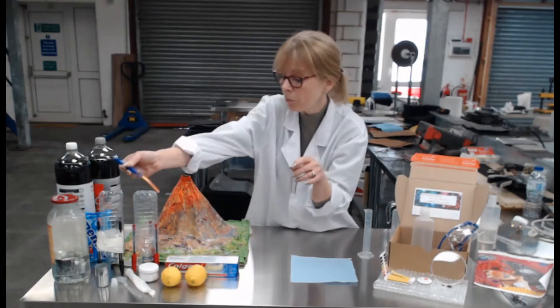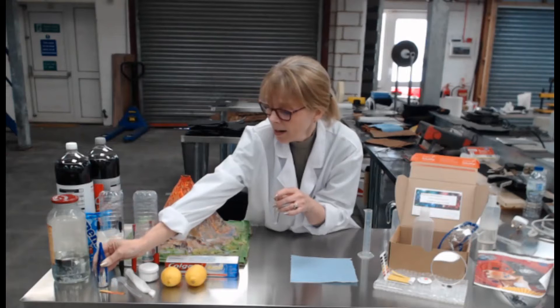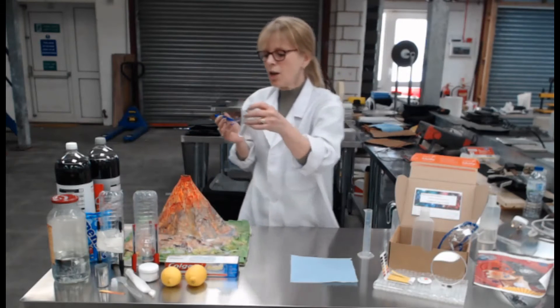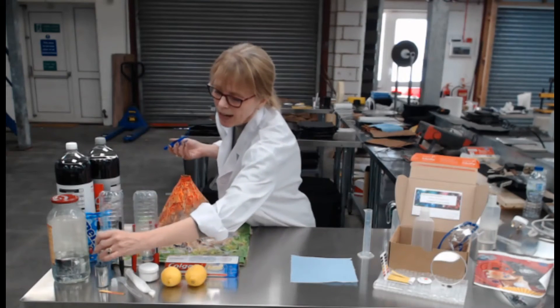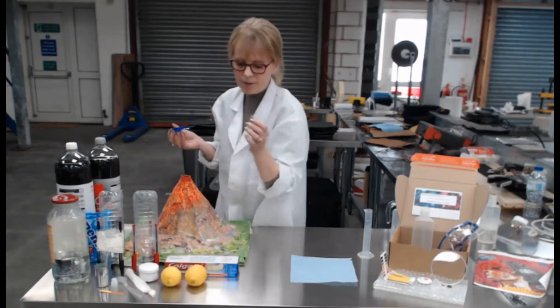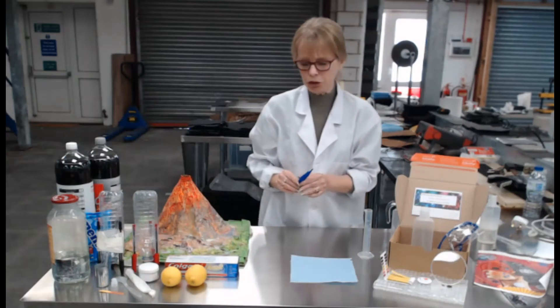And you could test and experiment with which things are going to have a lower pH, or you could look to see if they're alkali where it would be above seven. Seven is neutral and is what your water should be.